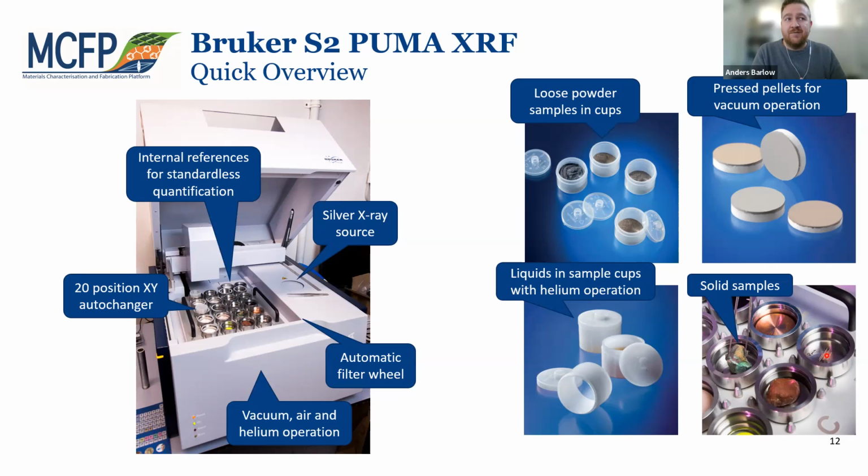We have a variety of different mask sizes. So this is an 8mm mask, for example, so there's a little hole just here. We have 8mm, 28mm, and 38mm masks as well for different sized solid samples. Okay, so that's XRF. That's our elemental identification.